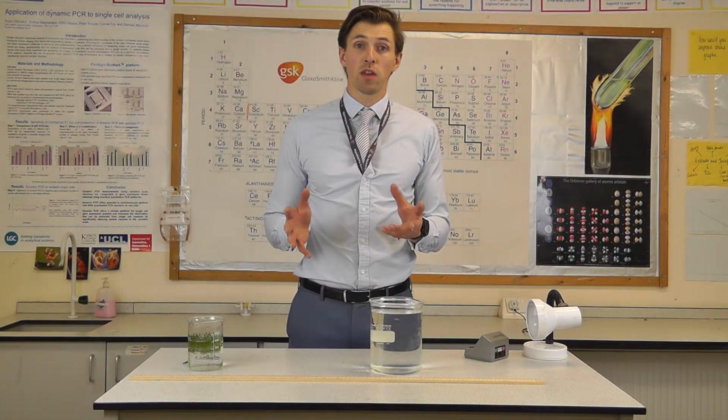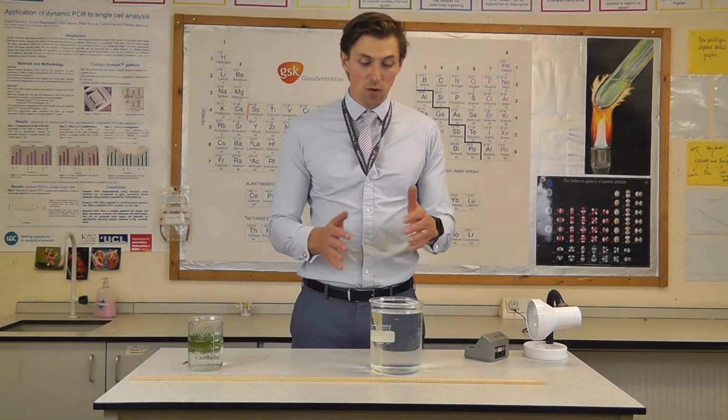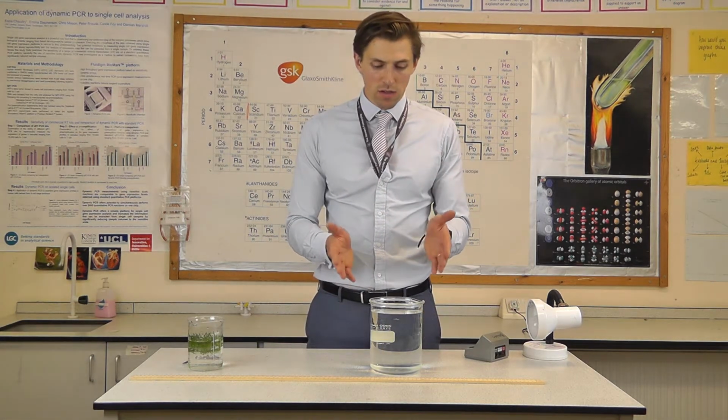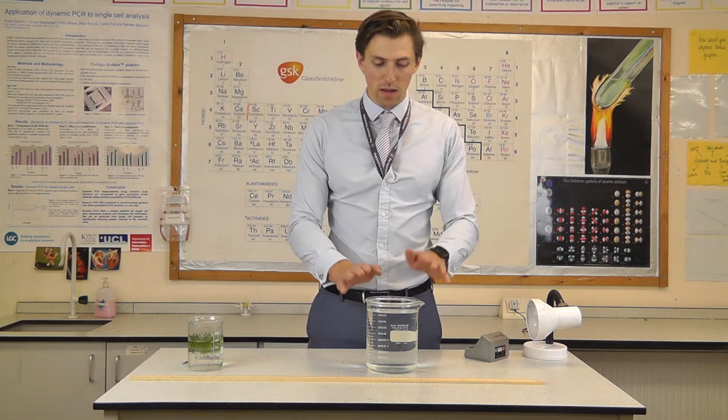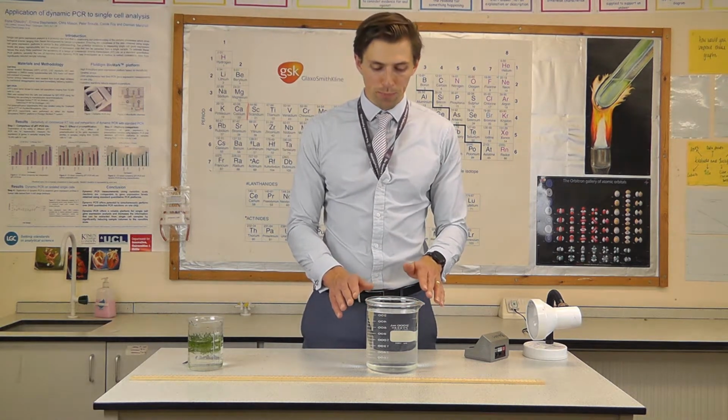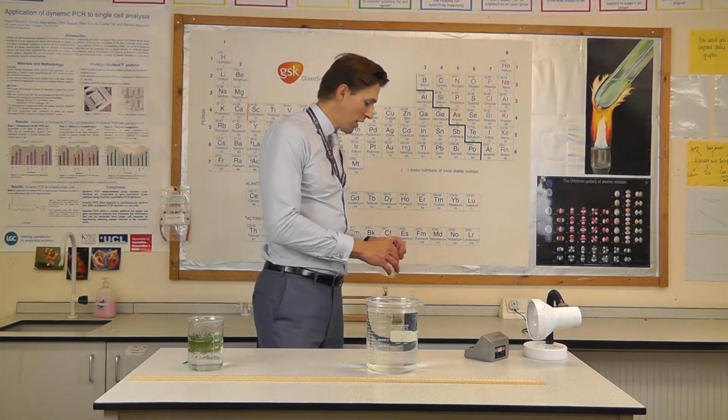Right, now the other way I was telling you that you could do this is by using an upside down funnel and then using a measuring cylinder. So just to demonstrate what this would look like, I have a very large beaker here of our sodium hydrogen carbonate, and I have an upturned funnel.